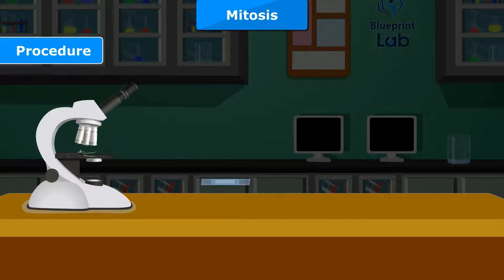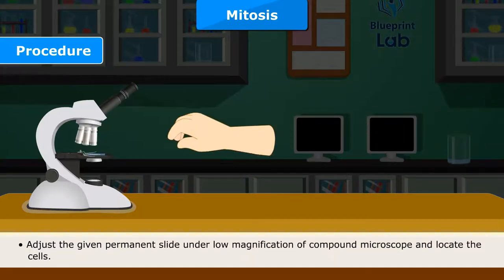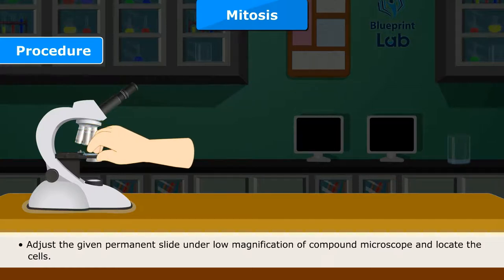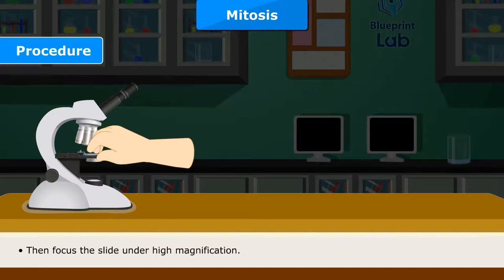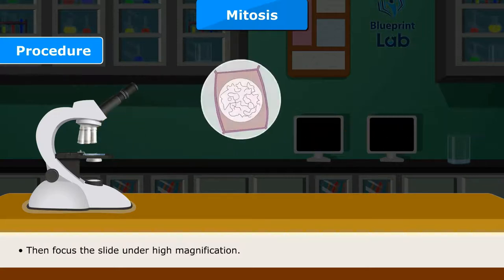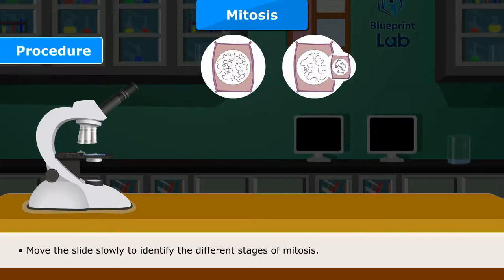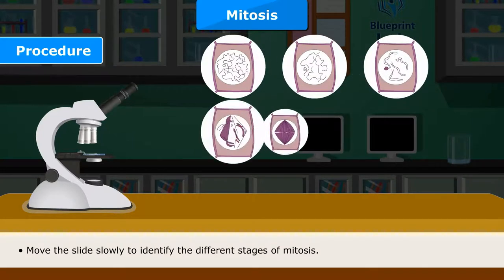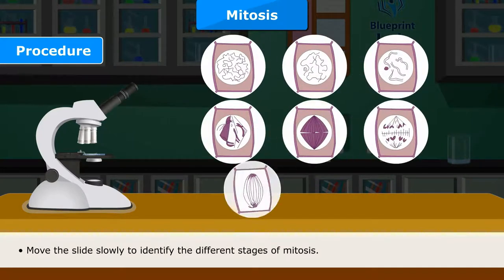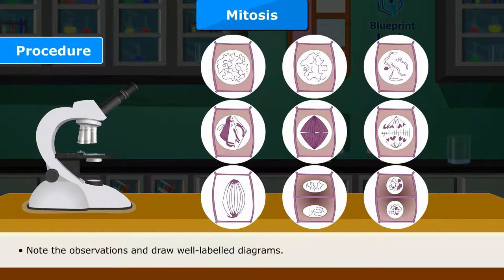Procedure: Adjust the given permanent slide under low magnification of the compound microscope and locate the cells. Then focus the slide under high magnification. Move the slide slowly to identify the different stages of mitosis. Note the observations and draw well-labelled diagrams.